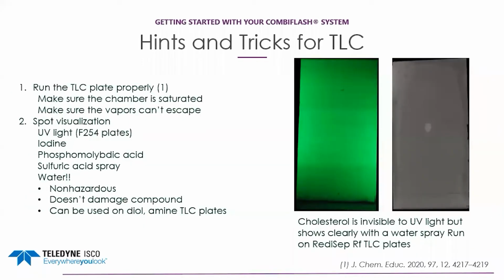Make sure you run your TLC plate properly. You see a reference on the screen from Journal of Chemical Education. The reference is at the lower right. But running a TLC plate properly means making sure the TLC chamber is saturated with vapor before running the plate. Make sure the chamber stays saturated by making sure the chamber is completely sealed. This doesn't take much time for most solvents if you prepare the TLC chamber with the solvents before spotting the plate.